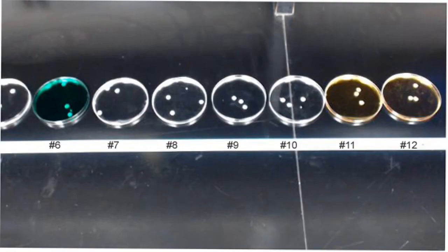I've moved the video camera so that you can now see the remainder of the 12 dishes that I've put out for you. Now, something you should have noticed, in each dish, there are 3 small discs. Each of those discs has been sterilized and is composed of absorbent paper. What I'm going to demonstrate to you is how I am going to transfer these discs to the plates that we need to work with for this module.